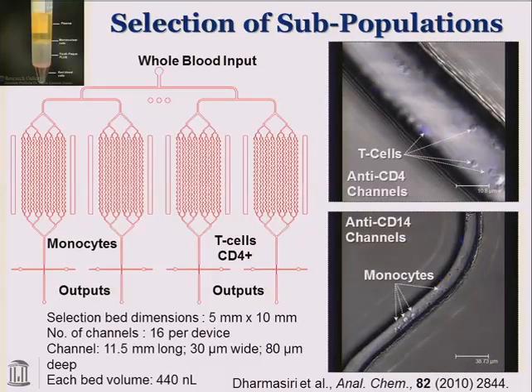Well, there are several ways to do that, the way this is designed. One way is to expose only this section through a UV mask to generate that functional scaffold. And when you influx those antibodies, only that area that was exposed to the UV light through a contact mask will be used for immobilizing those particular antibodies. You could do that sequentially then.